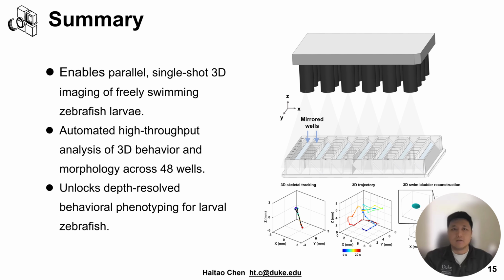In summary, we present a platform for parallel single-shot 3D imaging of freely swimming zebrafish larvae without mechanical scanning or behavior constraint. By combining a mirror well plate with a multi-camera microscope, the system enables fully automated, high-throughput analysis of 3D behavior and morphology across 48 wells simultaneously.